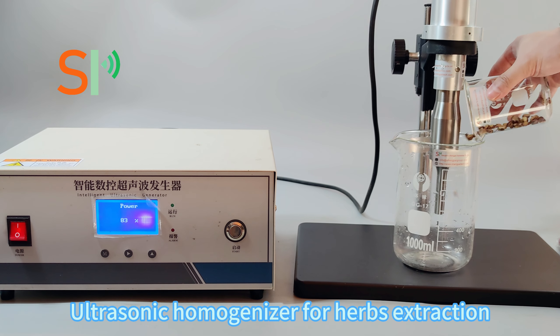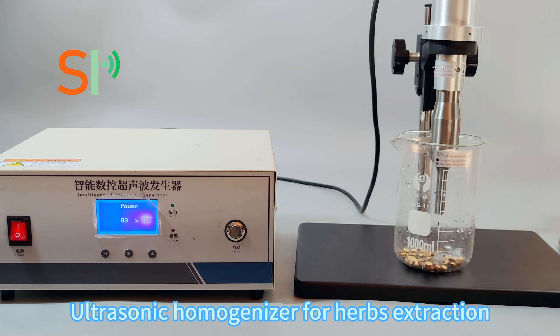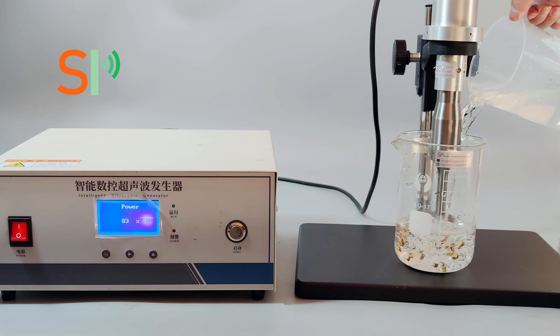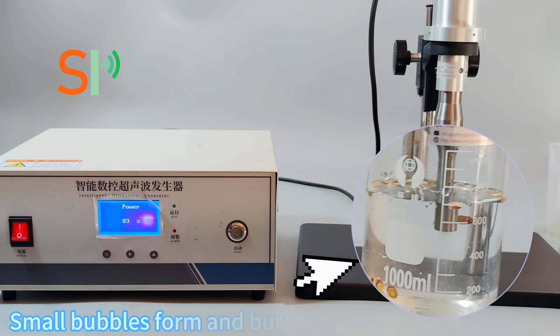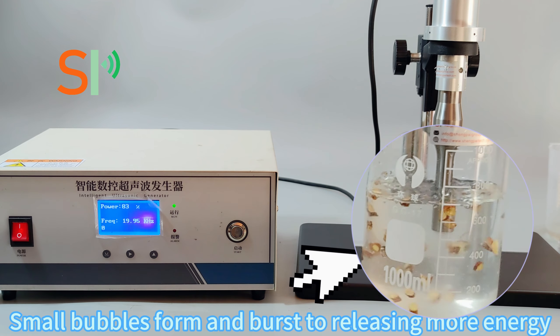Ultrasonic homogenizer for herb extraction. Small bubbles form and burst, releasing more energy.